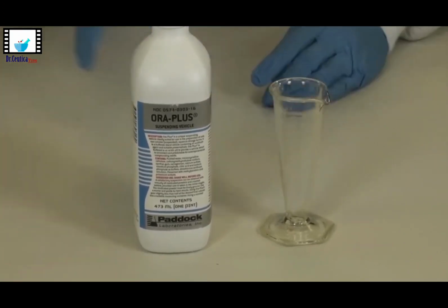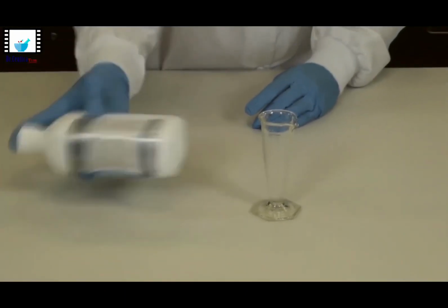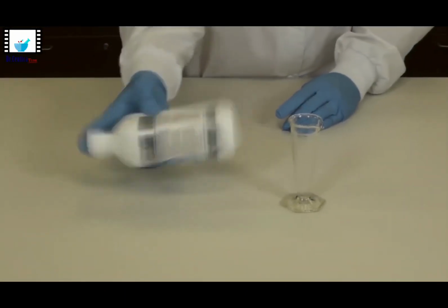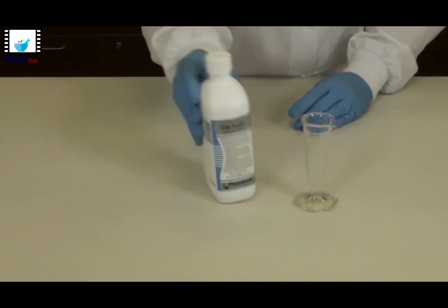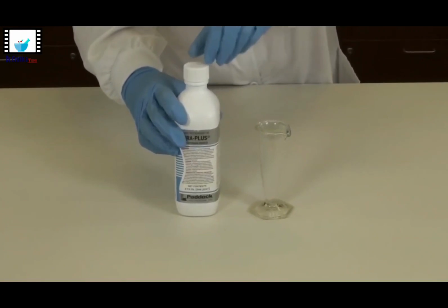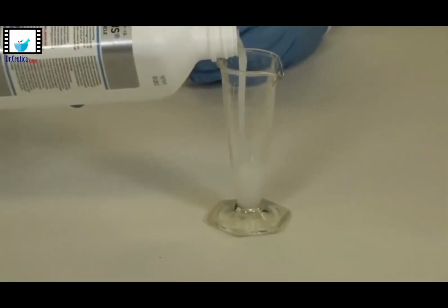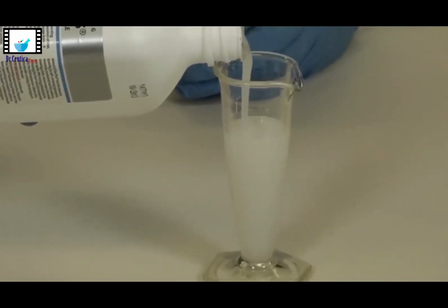It's okay either way, and there are lots of schools to follow in pharmaceutics compounding. So it's okay, don't worry, as long as your final preparation is well compounded, it's not a big deal what procedure you actually followed.